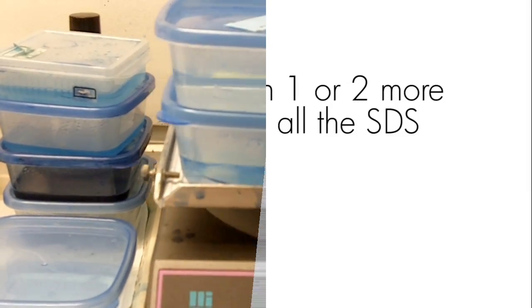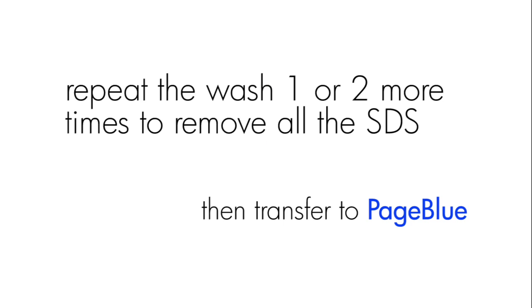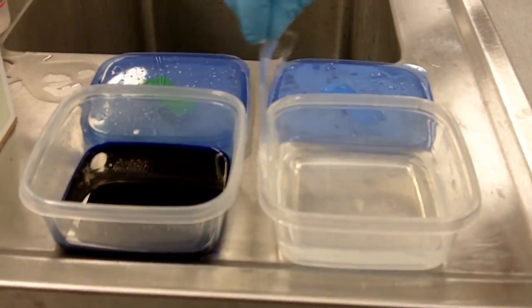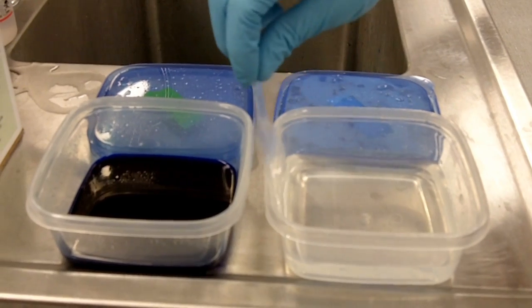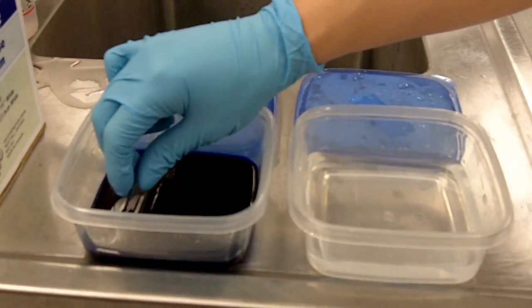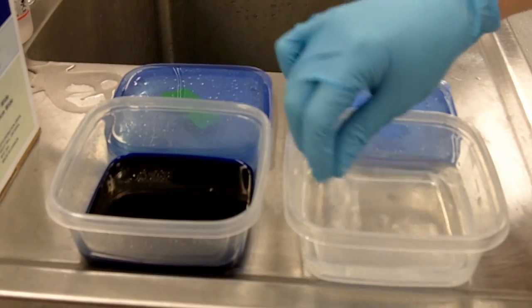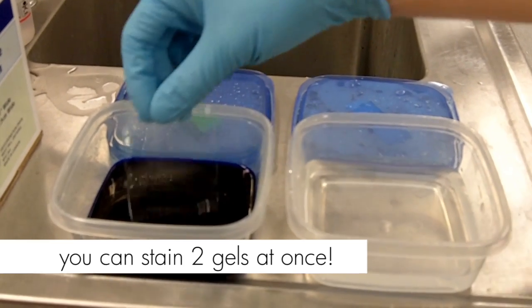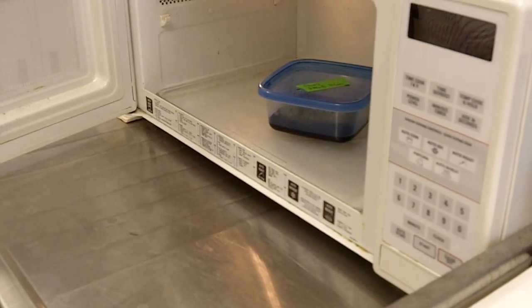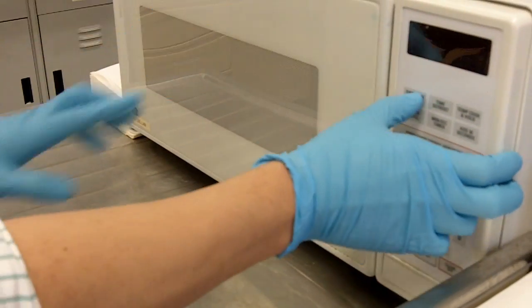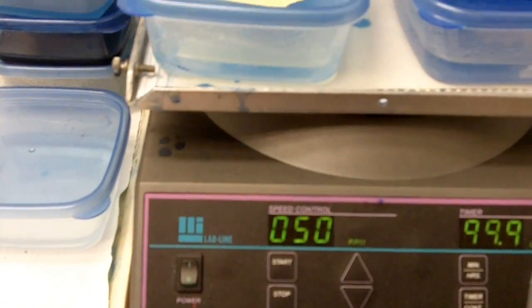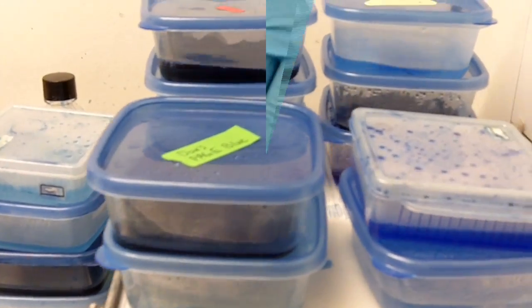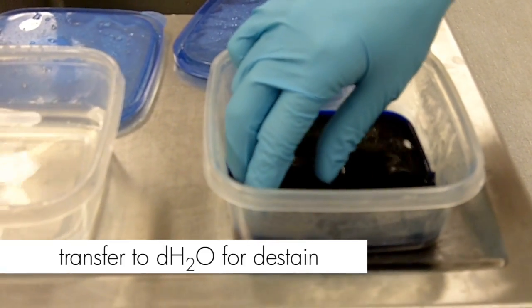Before we transfer the gel, we want to make sure we remove excess water because we would not want to dilute the dye. We will microwave this for about 30 seconds. By heating it up again, this helps the dye to be absorbed into the gel, and we'll let it shake on the shaker for about 10 minutes. You can shake it longer if your dye is not as fresh.